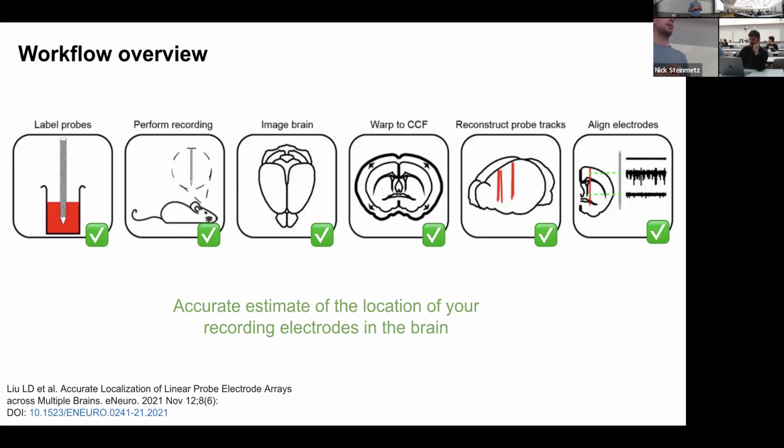We are using polymer probes. We have to split the electrode in order to insert it, and we're using PEG stiffening. The question is whether we should coat with the dye before or after the PEG coating.